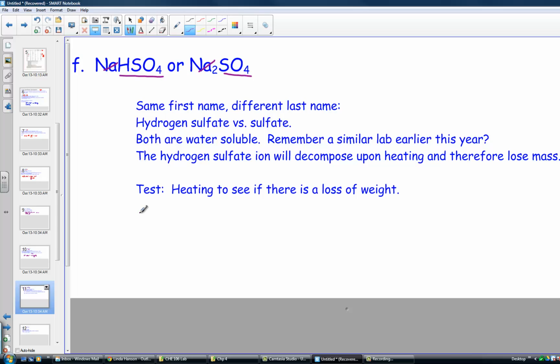So if indeed my, let's just write sodium hydrogen sulfate because it starts solid, and I place it over a flame, and so I'm just going to denote that by saying a little arrow there, out comes a little bit of mass loss. So we end up going straight to the sulfate, and we release actually sulfur trioxide and water vapor.